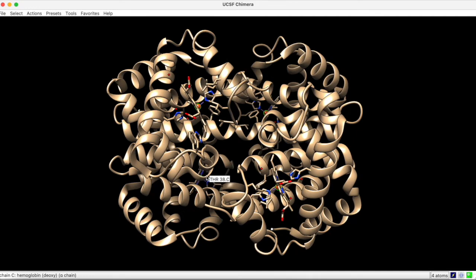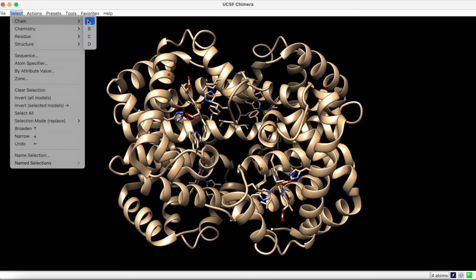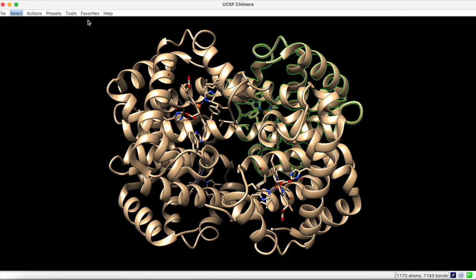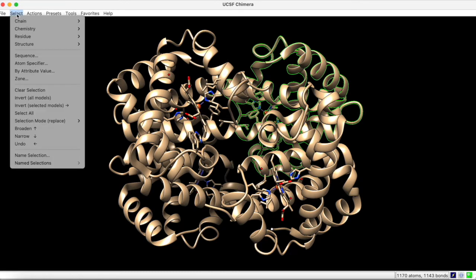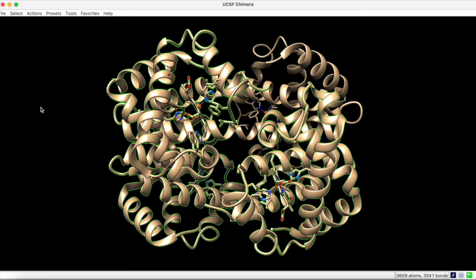Of course, Chimera allows for broader selections than this. To select an entire chain, we can select by chain. Now, the entire chain A is highlighted in green. We can play some tricks here such as selection inversion, which inverts the selection to everything except chain A.